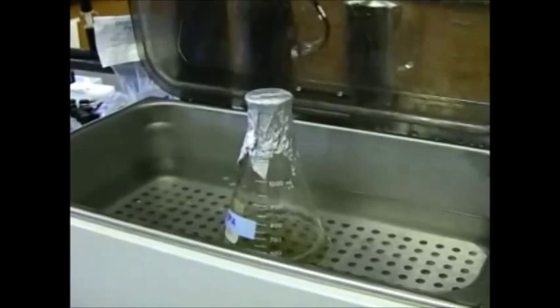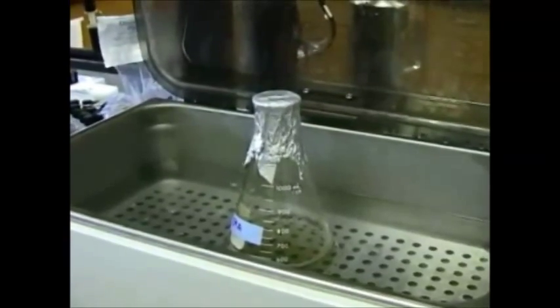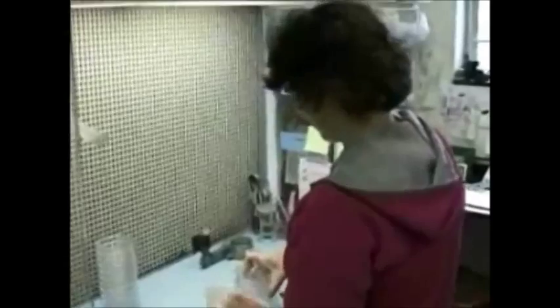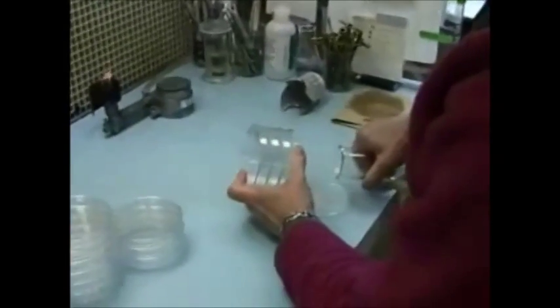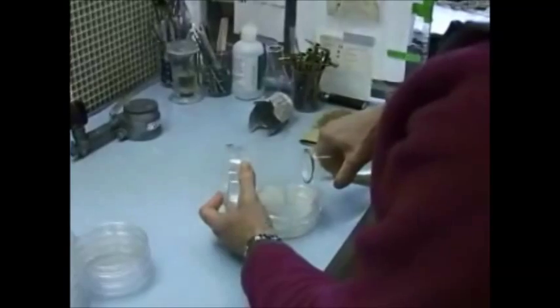This water bath step just allows the agar to cool off gradually to a temperature that we can work with and pour the plates. So Calla's going to go ahead now and get the flask ready to go so she can pour her plates. She's got petri plates there. The plates have ridges around the edge so you can stack them and they won't slide off — they'll sit in stacks of 20 or so. Right now she's flaming the neck of the Erlenmeyer flask to kill any spores that might have landed in there while it was in the water bath.